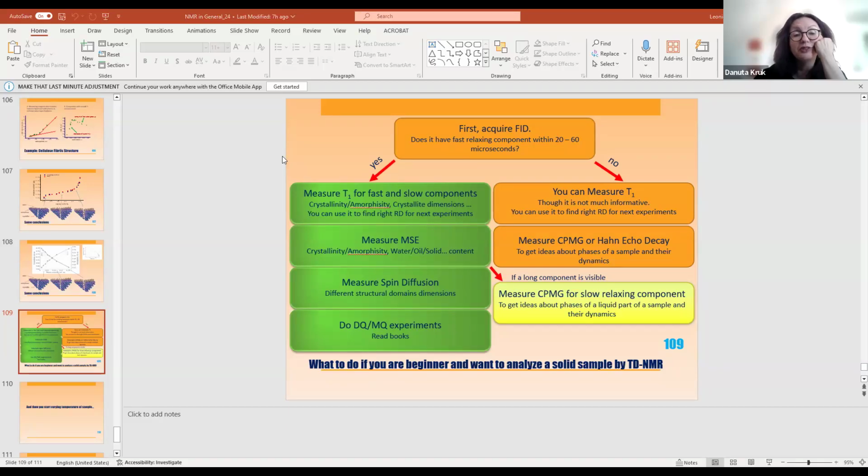And this is a kind of special case of a proton-fluorine system. However, even if you have only protons in your system, quite often spin-lattice is single exponential, spin-spin bi-exponential. This is physics. Different exchange times. Normally, spin-lattice is much longer, and then exchange might happen within the relaxation process.